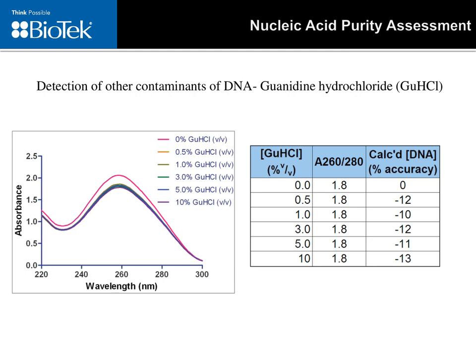So a common method to ensure sample integrity when purifying nucleic acids is to treat the source samples with a denaturant to remove ubiquitous nuclease activity. Guanidine hydrochloride at a stock concentration of 8 molar is typically added to lysis or homogenization buffers during the sample preparation.